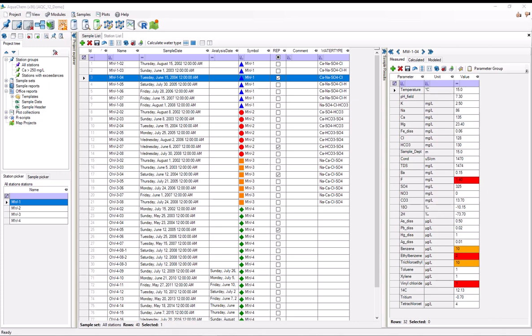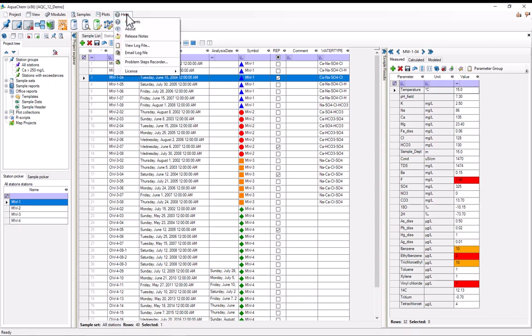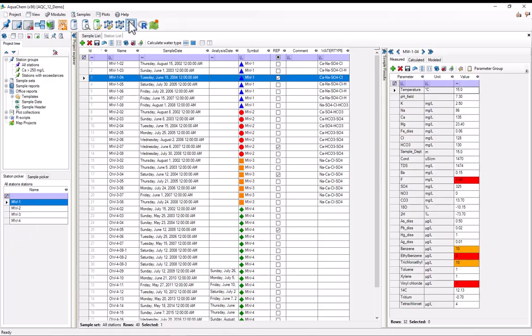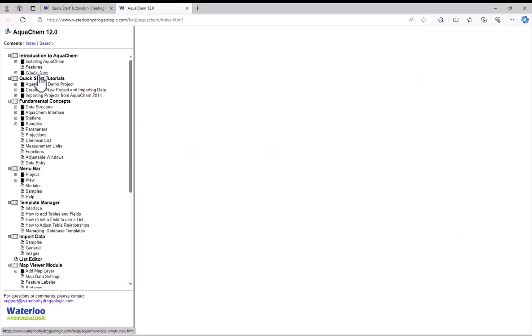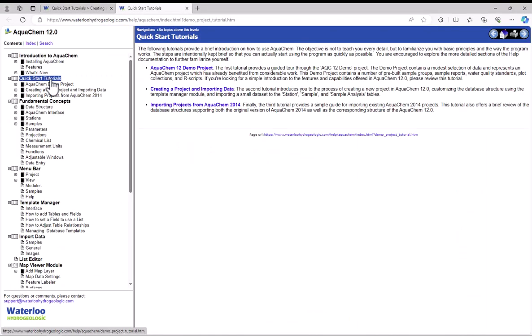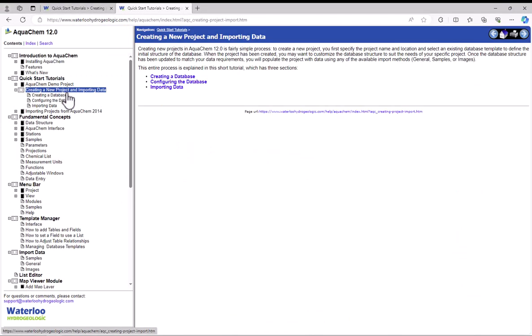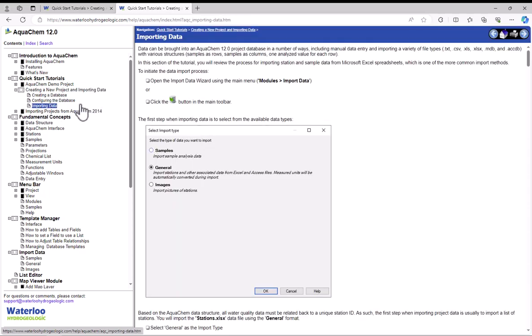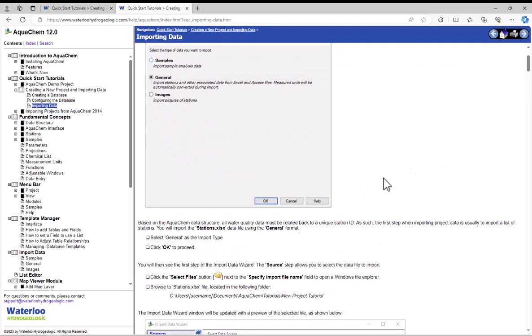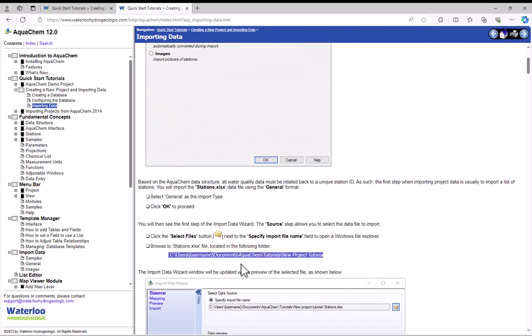So before I jump off and start importing data, I want to point out that AquaChem actually ships with a tutorial on importing data. To find that, you'd go to help, contents, and then under quick start tutorials, you want creating a new project and importing data. And specifically, you'll need to work to the importing data section. Here, you'll see that the tutorial includes some example data for you to import.